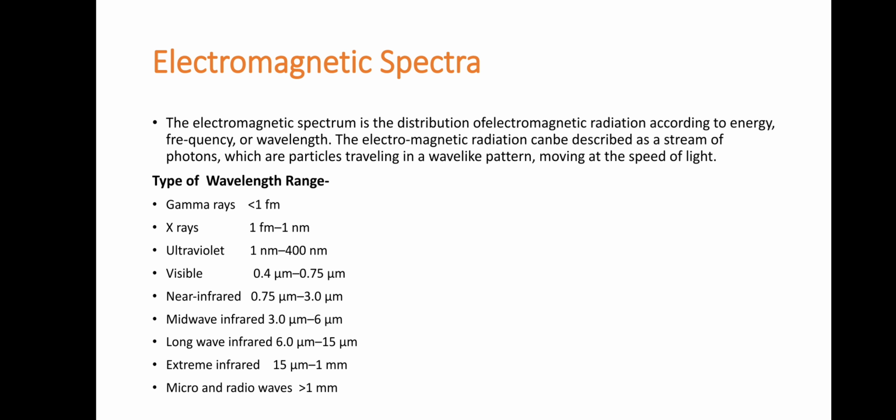The infrared region is divided into 4 regions.